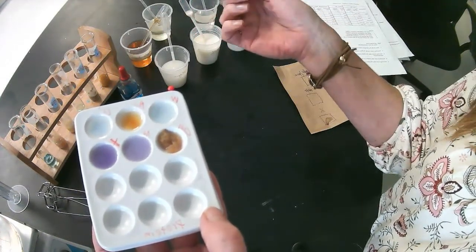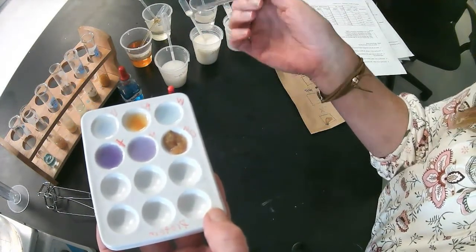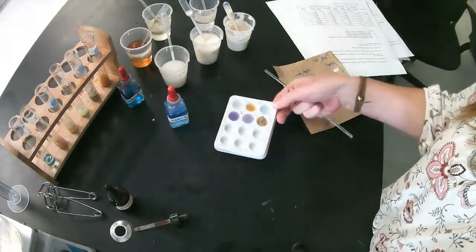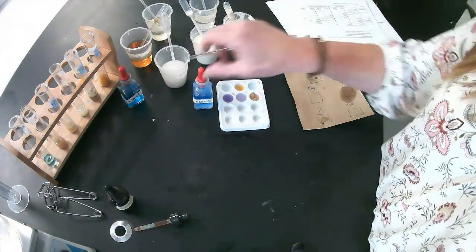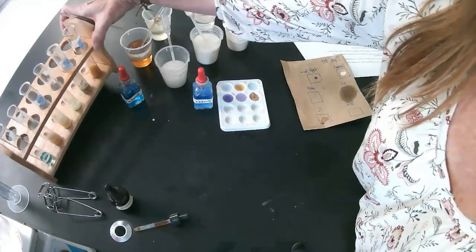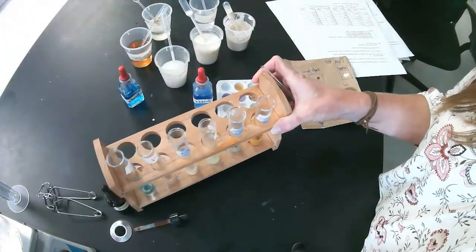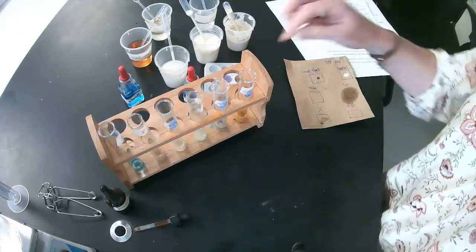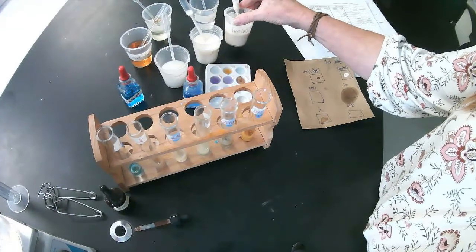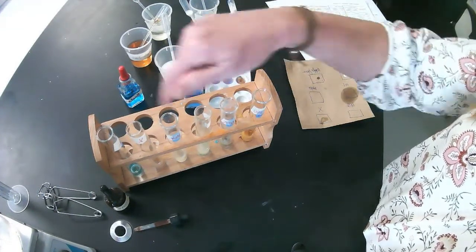So that should be listed on your table. Let's see, yep. Milk and unknown X are both positive for protein. Awesome, okay. And then the next one is the Benedict's reagent test for simple carbohydrates or sugar. So I'm going to show you each test tube. So these were the substances. Put 2 milliliters of each substance, each in a separate test tube.